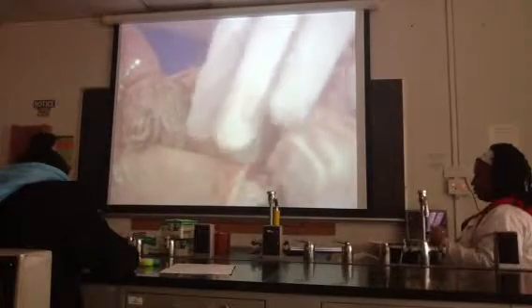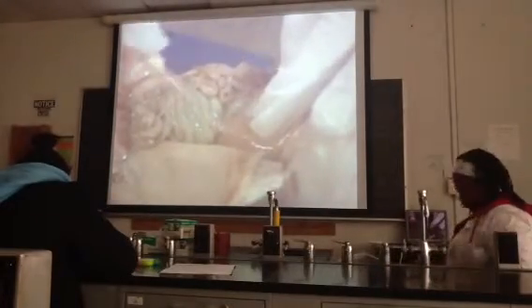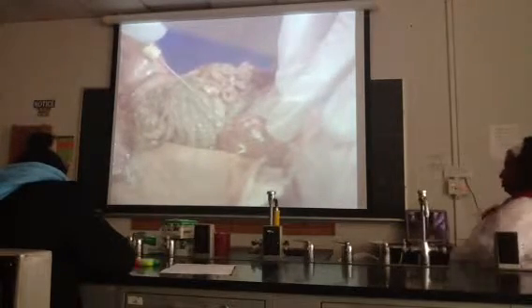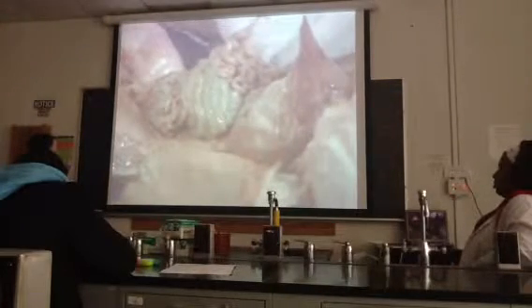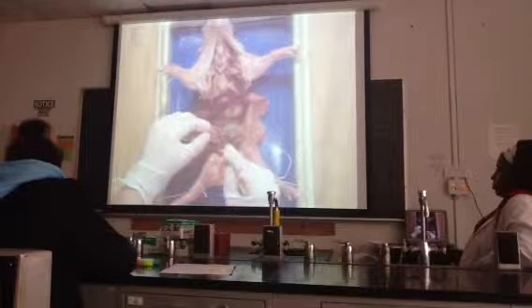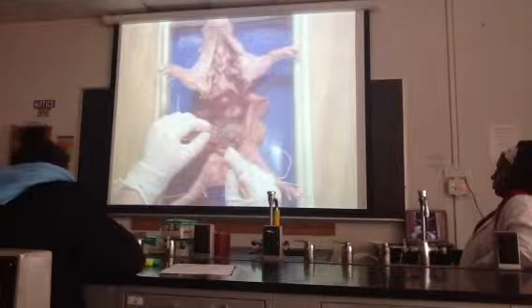If we lift up the stomach and the spleen, we can see underneath this structure a granular organ known as the pancreas. The pancreas functions in producing digestive enzymes, which will also be used in digestion. Over to this side, we see a mass of coiled tubules. These are known as the small intestines. This is where most of the chemical digestion takes place and the absorption of the digested food.